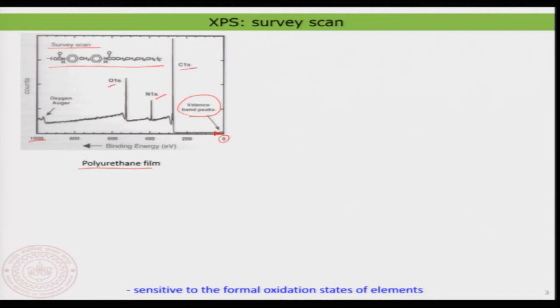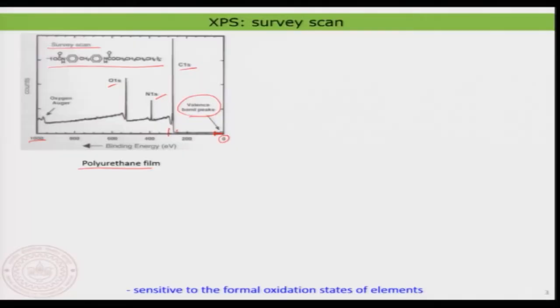What is quite striking is that the carbon peak is the most intense, nitrogen is the lowest, and oxygen is intermediate in intensity. That clearly tells me this is some kind of proportional chemical analysis — carbon is highest as expected, nitrogen lowest, oxygen intermediate. Already the survey scan is quite promising, but now we can look into each element separately by zooming into a small window of energy.